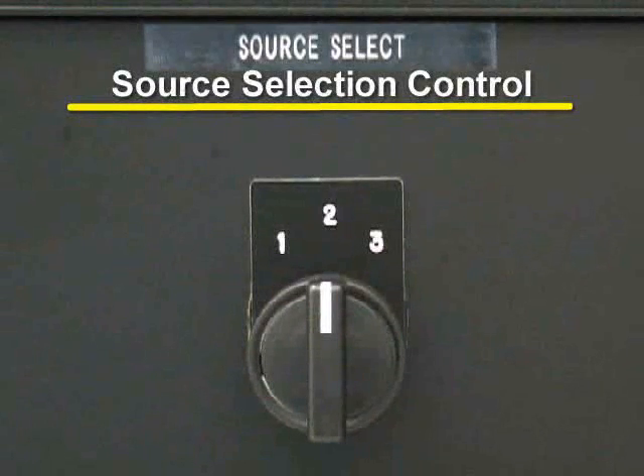There is also a source selection control. This dial selects which pair of electrodes will receive power during processing.